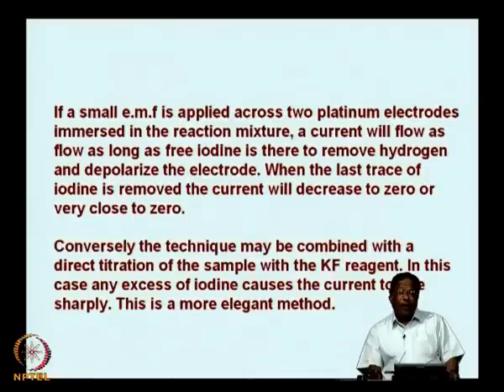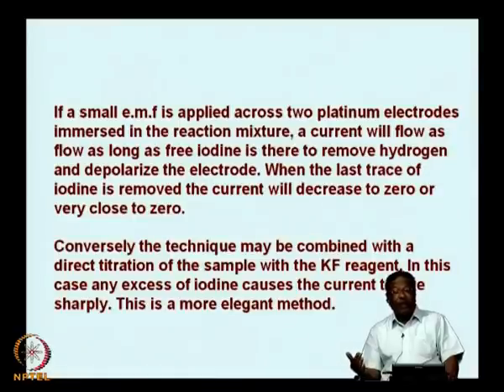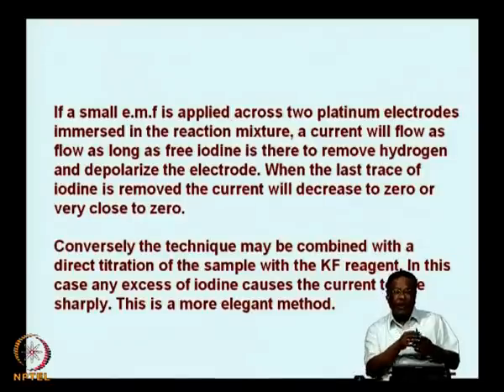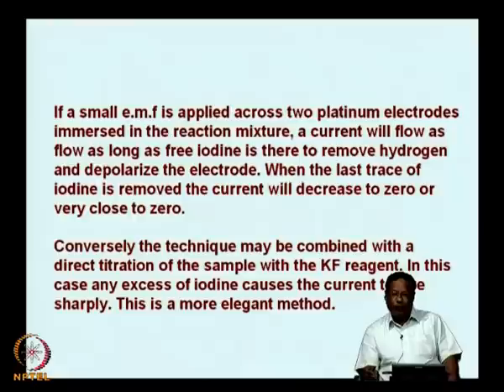When the last trace of iodine is removed by reacting with the water molecule present in the sample, what happens to the current? The current will decrease to 0. So, initially you will get a very high current reading, and then as you keep on titrating, the iodine will get consumed and the current will keep on decreasing, and when the last trace of iodine is removed, the current will become 0 or very close to 0. Such reactions are known as dead stop reactions.